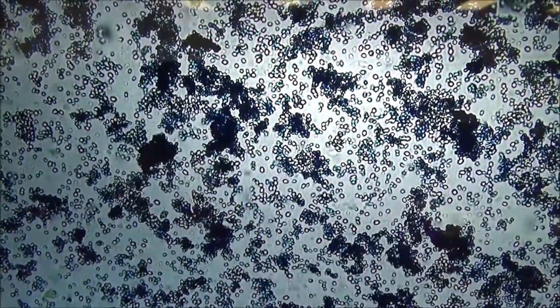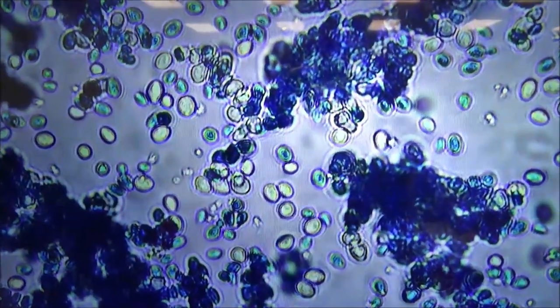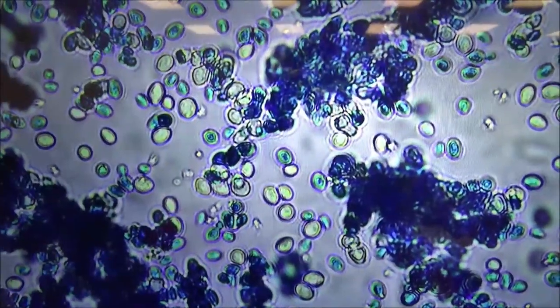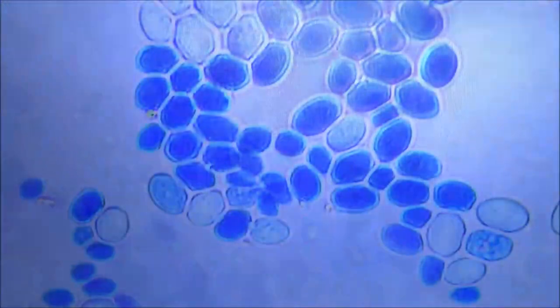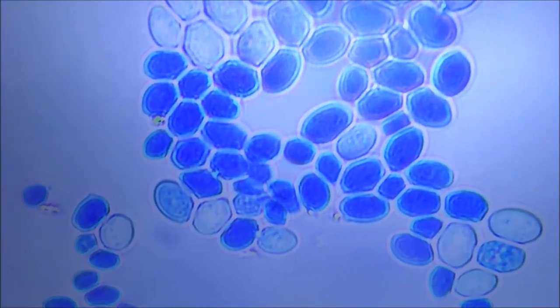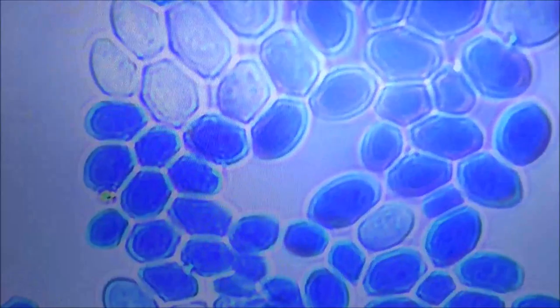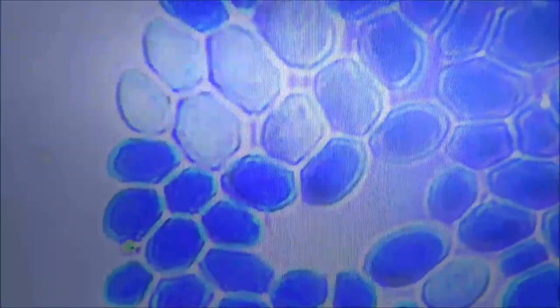Here's what they look like at low power. Here's a little higher magnification, this is now 10x objective lens. Let's go higher. Here they are at 40x objective lens, 400 total magnification. Let's go ahead and look at these under oil immersion. Here they are, yeast cells at 1000x magnification. If you look really carefully, you might be able to see some organelles inside those eukaryotic cells.